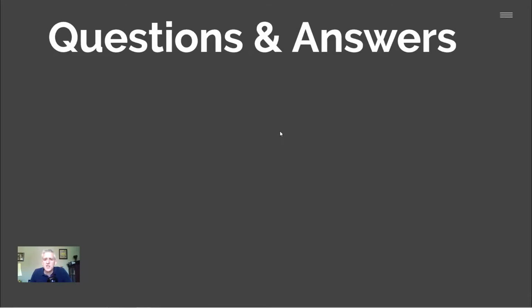Next question, is it possible to use Dragonfly functions in Python? Yes, everything in Dragonfly is available in Python.